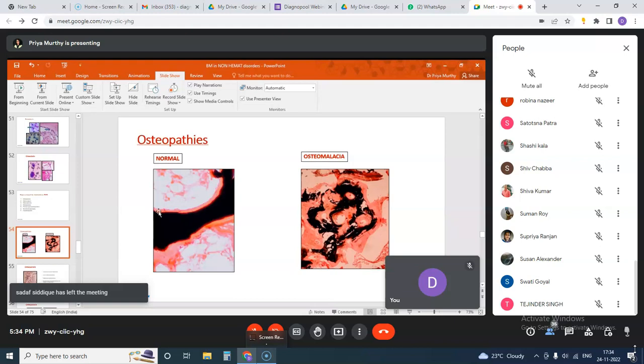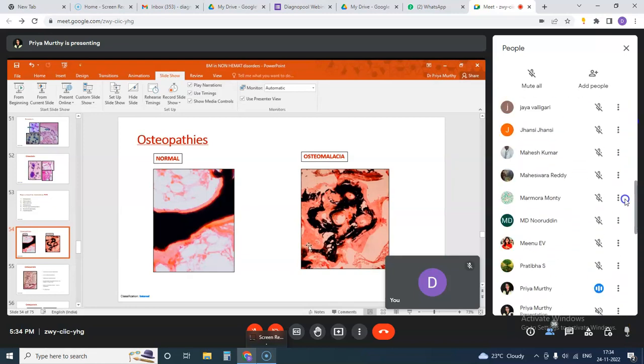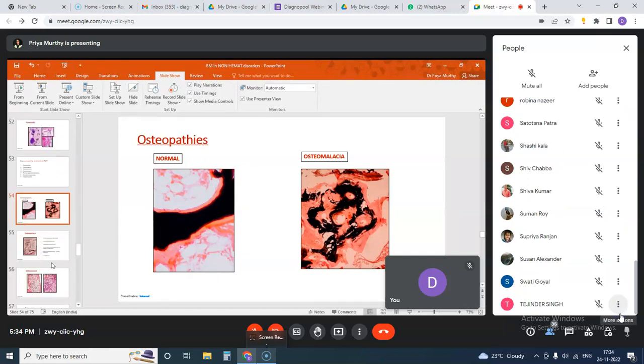And in contrast, if you see a case of osteomalacia, there is very irregular deposit of calcium, and the cortex is very uneven. See over here, this is all the unmineralized bone. The pink part is the unmineralized bone. Other stains that you can use to detect these are the Perls stain, which gives a blue line to this.